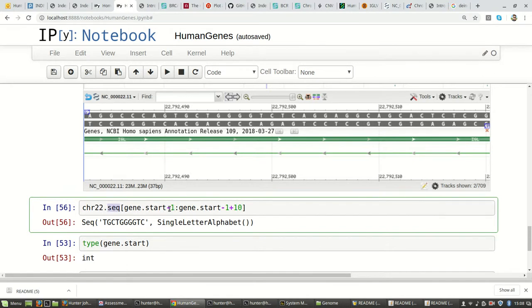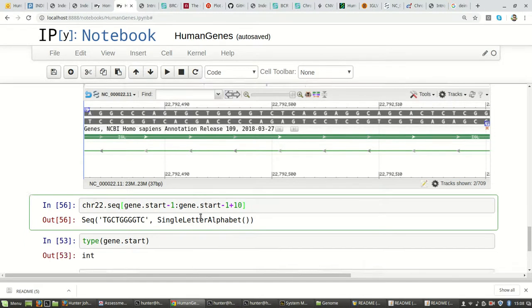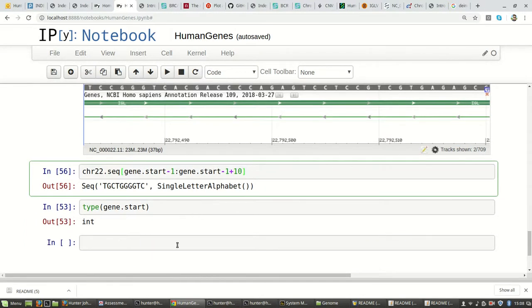and what I'm doing here is called Python array slicing. If you want to know more about Python array slicing, you can Google that. Let me do something more simple. I don't want to get too off topic, but let me just show you something about array slicing.